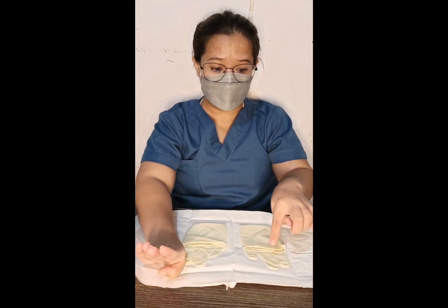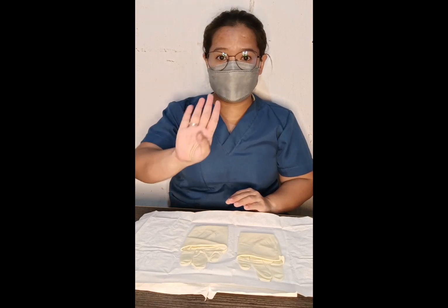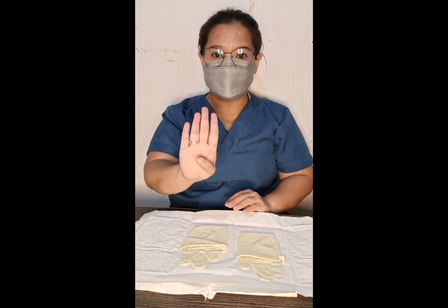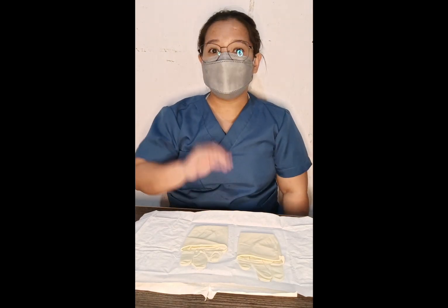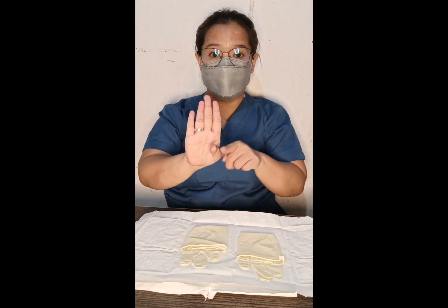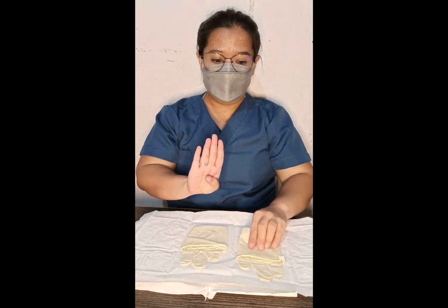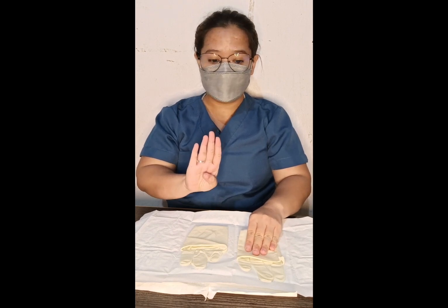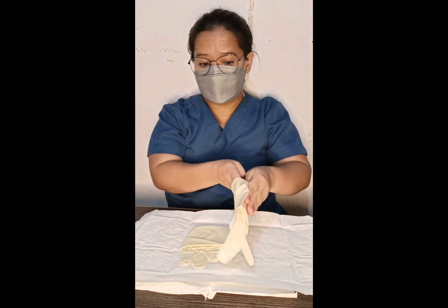This is the sterile part of the gloves, and this is the non-sterile part. I will be positioning my hands like this, folding my cuff like this, and then picking up the glove using my dominant hand. Like this, don't touch the sterile part. And what I'm going to do is insert my fingers like this.